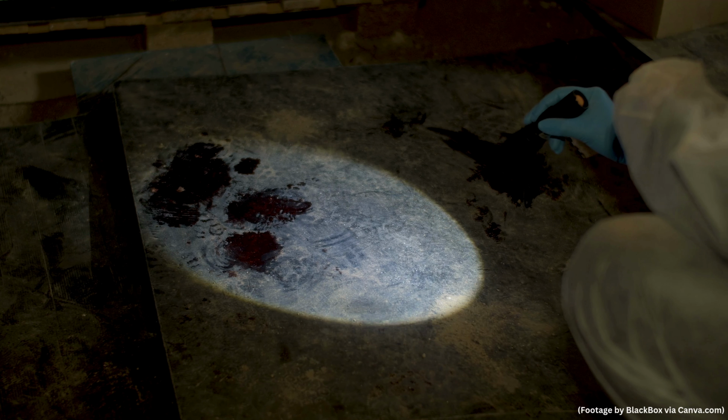The first scenario is, imagine someone commits a crime, and in committing this crime, they actually break into a building and they break a window to enter the building, and in doing so, they actually cut themselves on the glass and they leave a blood sample at the crime scene. So, can we use PCR and the amelogenin gene to tell whether the blood sample comes from a male or female? The answer is that we actually can, and I'll explain more how that's possible in a moment.